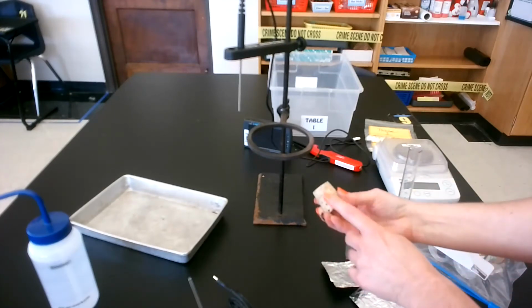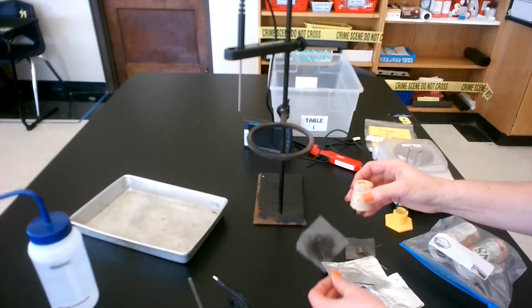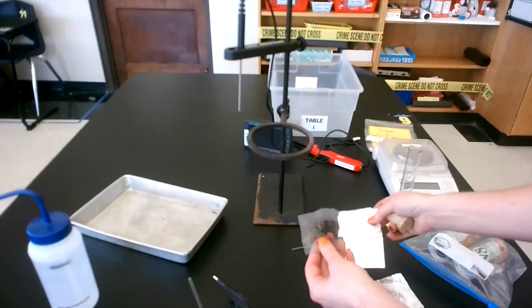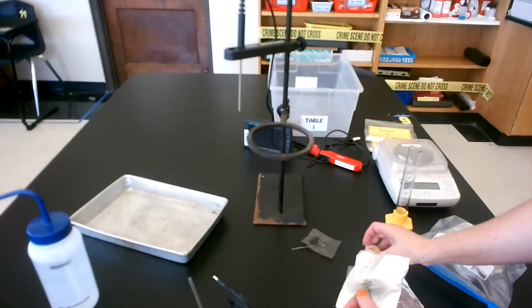Okay, so we're going to use this one cork for both of our food holders, but we don't want to reuse the foil, screen, and paper clip between the two food samples. So we'll clean up, we'll reuse the cork and build our next one.